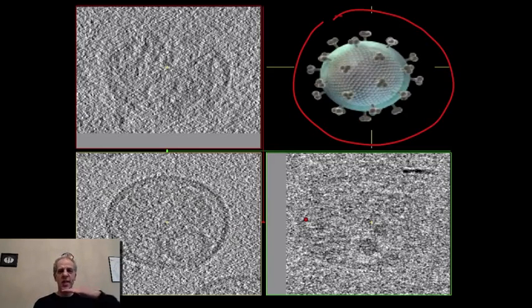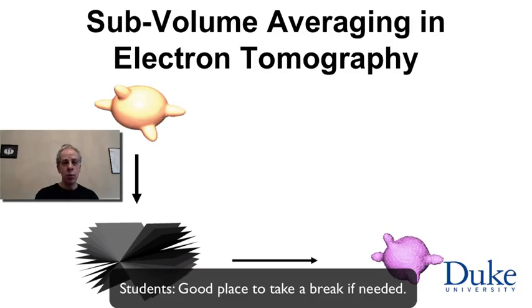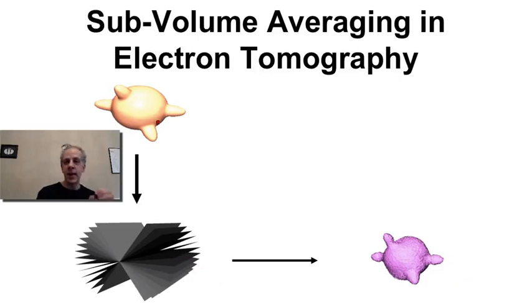Again, these are just slices on the 3D volume that was reconstructed with cryotomography. This is what we have. This is the process that we have. We had basically a virus or a structure inside a specimen. We took multiple projections. Look how I represented here the missing wedge. We didn't take the whole around projections. We basically have a missing wedge here. So we took that and we get a noisy version in this 3D volume.